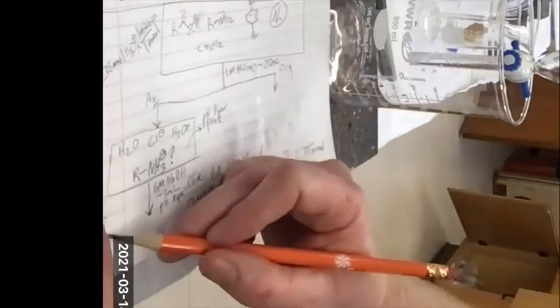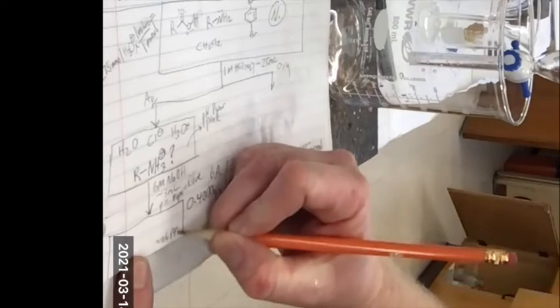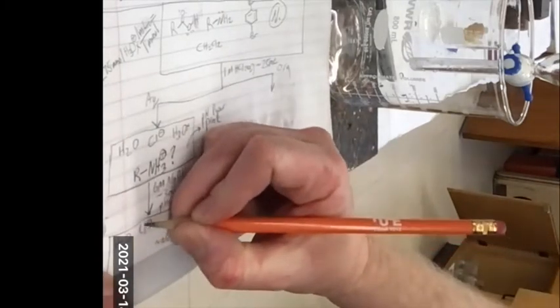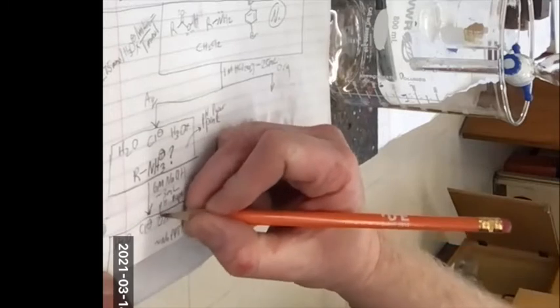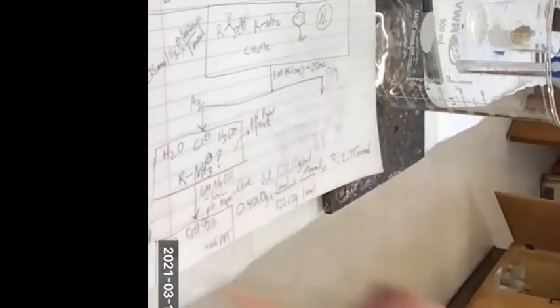Okay, so what should I have in solution at this point? If I say it looks like no precipitate to me, what's it mostly made up of here? Mostly water. You'll have some chloride and you'll have some hydroxide. And one other thing, the hydroxide, what did it come as? Sodium ions. Good. So let's assume that's the case.